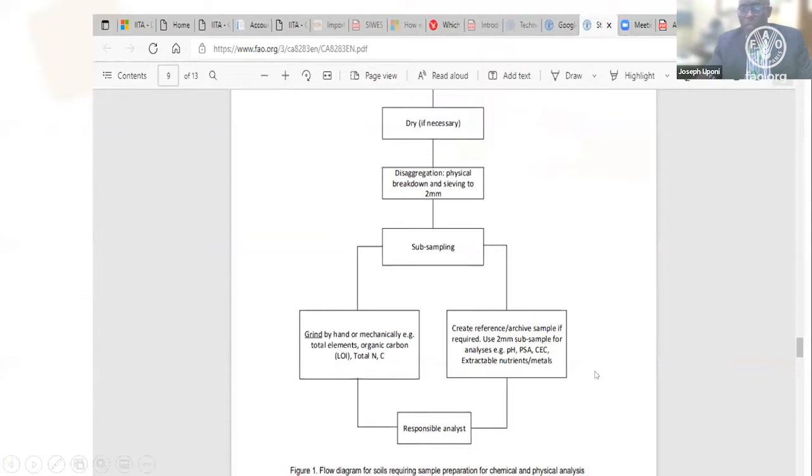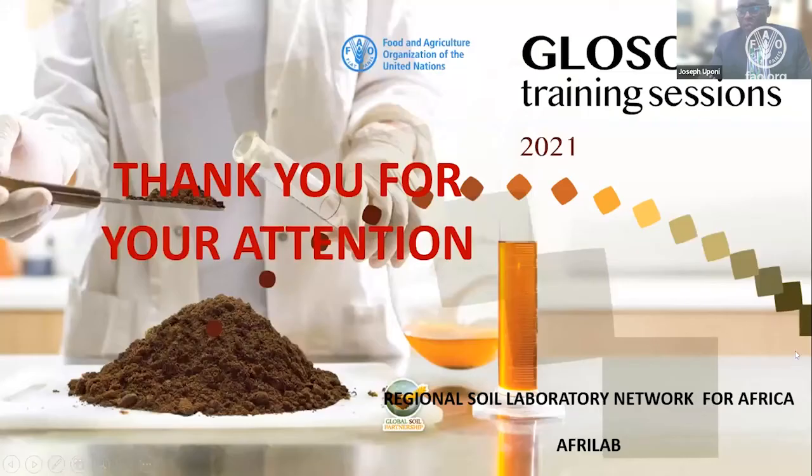Once analysis is done, it's important how your samples are handled for disposal. So please ensure that you follow the regulations in your locality for proper sample disposal. But if they are meant to be archived or stored, then you send them to the appropriate archive. That's just a brief rundown on soil sample preparation.